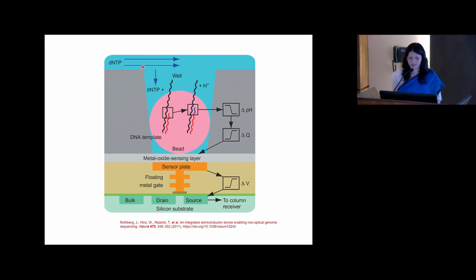This is a micro well, in which there is a pink sphere or bead on which the template is already formed. When we look at the overview, we'll come to know where this bead and template came from. But basically the unknown sequence that we are trying to decode is present on this template, against which the synthesis will occur. As you'll recall, this is also sequencing by synthesis, or the SBS method, in which the nucleotide will be added. So from where will they be added?